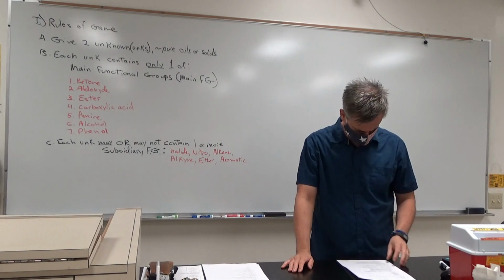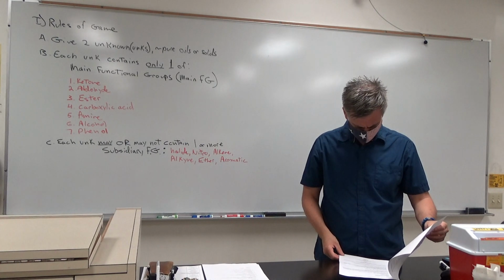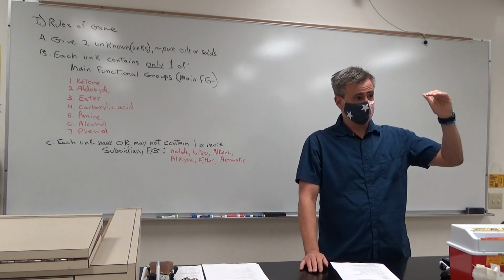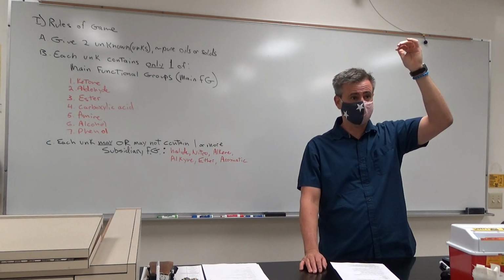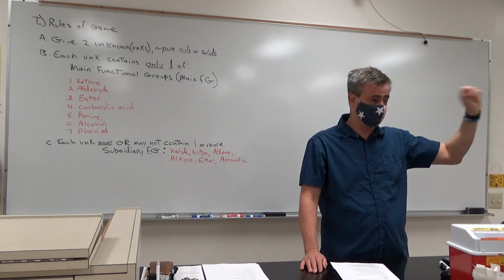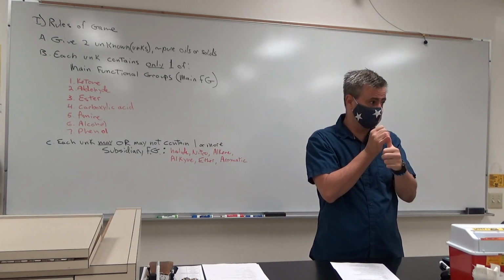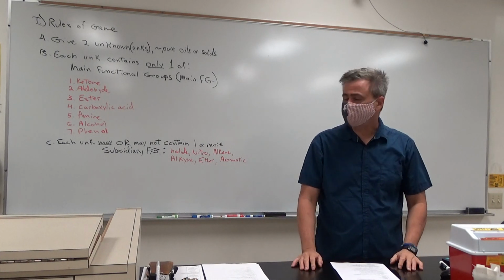You don't want to do all of the aqueous solubilities. There's a flow chart on page 462. It starts with water. If it's soluble in water, then it's a low molecular weight compound. Then you're going to use pH paper and litmus paper to decide: is it a low molecular weight carboxylic acid, or a low molecular weight amine?